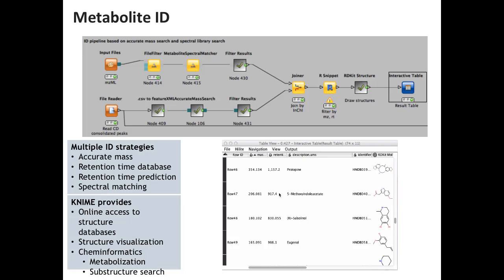So yes, you can basically cull your list of 50 structures down to 40 through retention time, but it's not going to bring you from 50 to one structure, because the error bounds in the prediction, even when you work really hard, are going to be in the range of about 3 to 10% of the overall gradient time. And that is too wide a window to really see much of a difference.